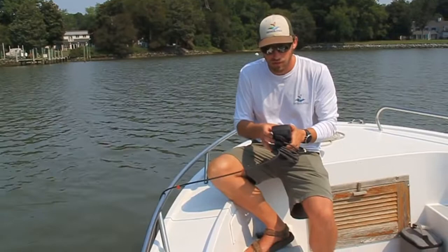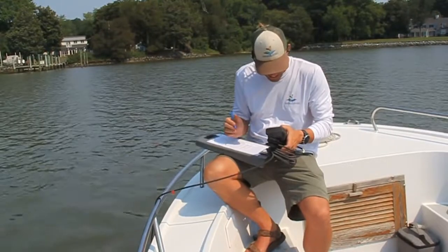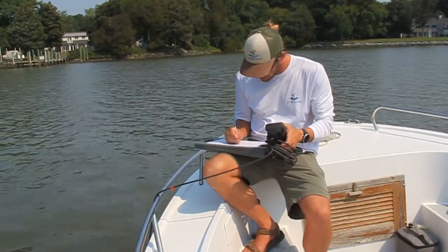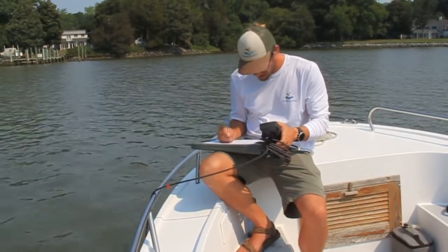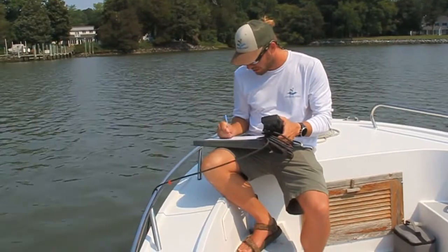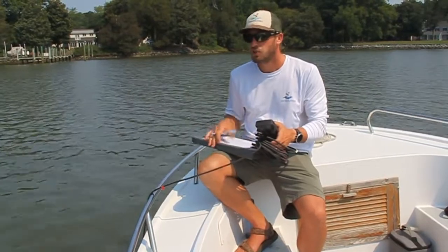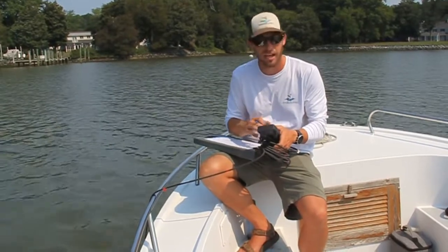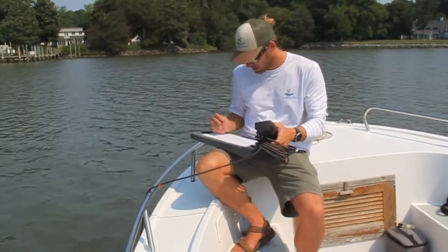So looking at our readings here, which we'll record on our data sheet, the sample depth that we have is 10.1. The temperature here is 28.5 degrees Celsius. The dissolved oxygen percentage is 73.5, and the dissolved oxygen in milligrams per liter is 5.39. So that's a good oxygen reading for the bottom of the water column. We start to see stressors occur when the oxygen gets below 5 milligrams per liter. And so the fact that we're at 5.39 is a sign that we're in healthy conditions for fish and other species to inhabit this area.